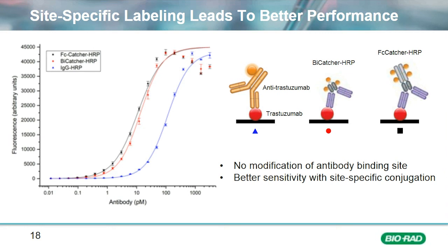In terms of interpreting these results, we assume that there must be some modification to some of the antigen binding domains of the mammalian expressed antibody, because we certainly seem to achieve better sensitivity with the SpyTag versions.